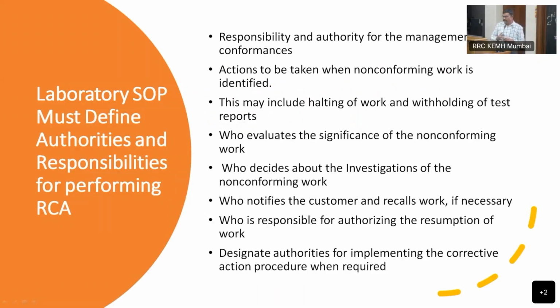So lab SOP must define authorities and responsibility. Who should do this RCA? Ideally, RCA should be done by the technicians. I tell you, it's not a job of the consultant. Don't do that. Really, I'm telling you. Only the technician will know everything. Okay. I used to give an example.